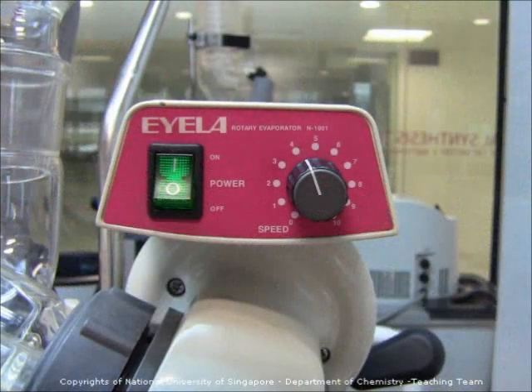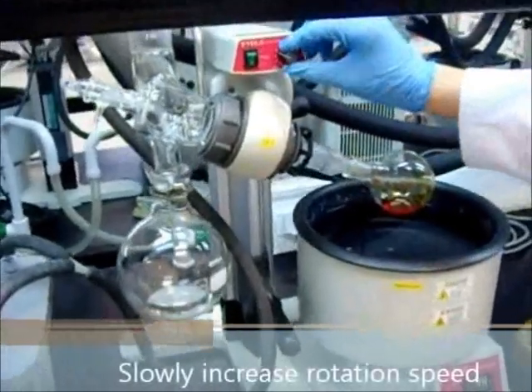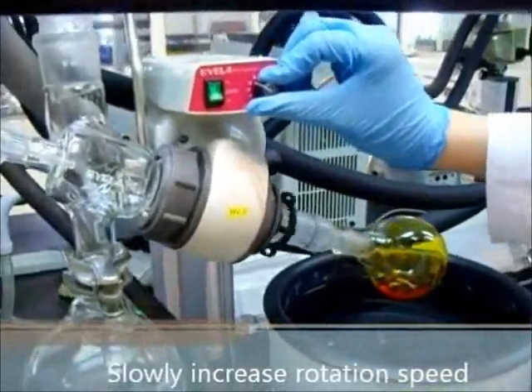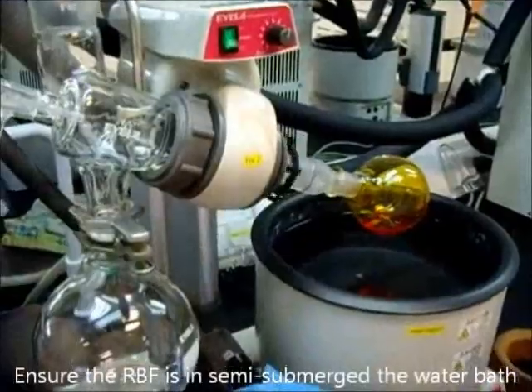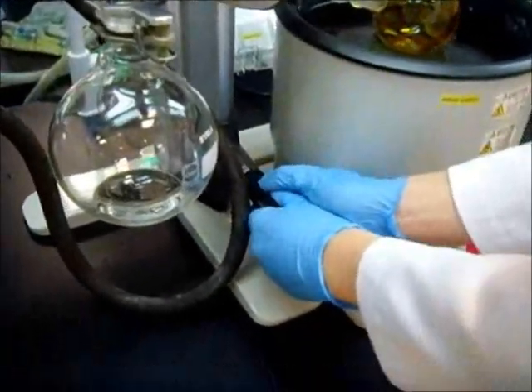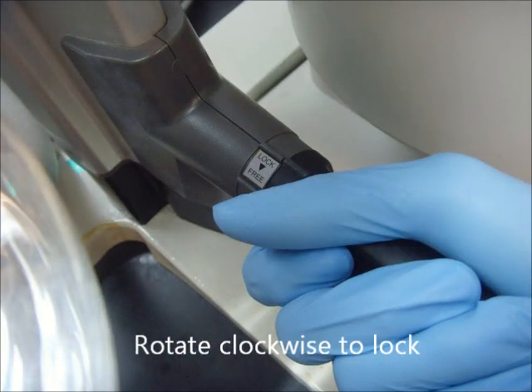Switch on the rotation and slowly adjust the knob to the speed that you want the flask to rotate. Slowly increase the rotation speed of the rotary motor. Unlock the lever by rotating it anti-clockwise. Using both hands, lower the whole setup so that the flask is semi-submerged in the water bath, then re-lock the lever.